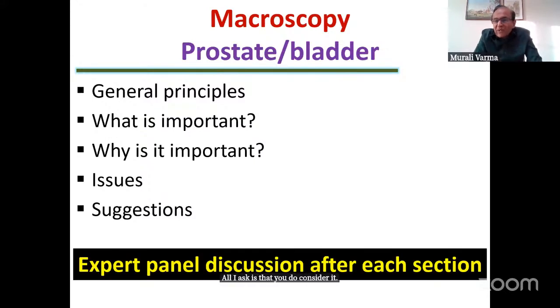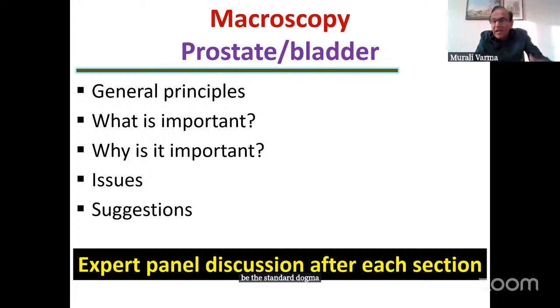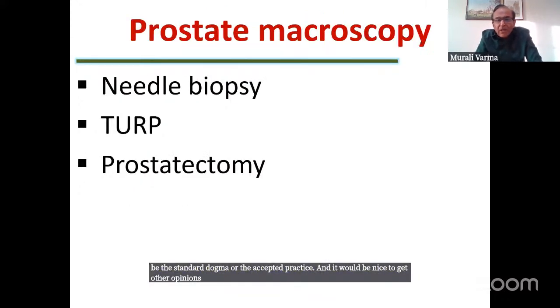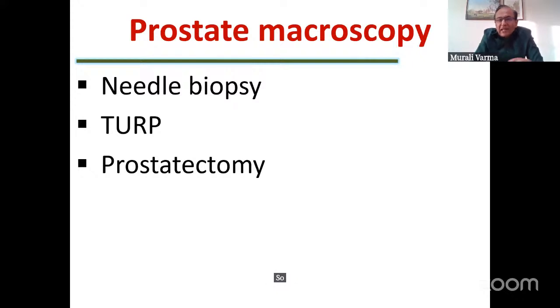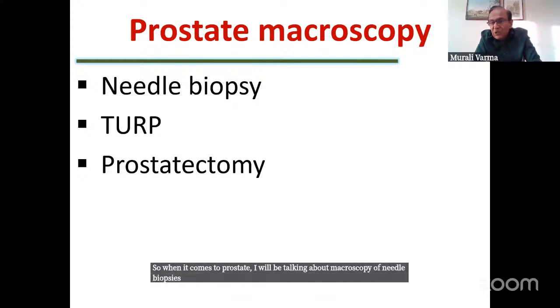And then, of course, we have got our wonderful expert panel. So at every section, where I have got my opinions, which may not be the standard dogma or the accepted practice, it would be nice to get other opinions into it. So when it comes to prostate, I will be talking about macroscopy of needle biopsies, TURPs, and prostatectomies.